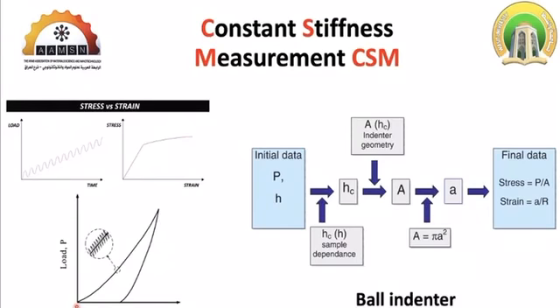We can use the results of this sophisticated technique to build up a stress-strain curve and define the elastic region and the plastic region by following this procedure.